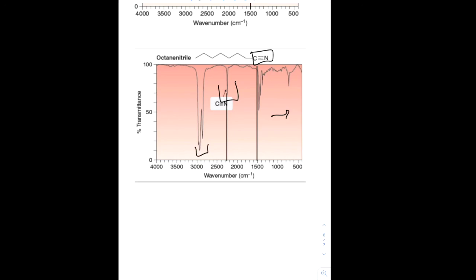In addition to that, this nitrile group would have an odd mass because of the presence of that nitrogen. So if you had the option to observe what the mass spec was, then that would be a way to identify or differentiate between the nitrile as well as an alkyne. Now, that's the common methodology, using mass spec as well as IR together to determine the unknown structure.